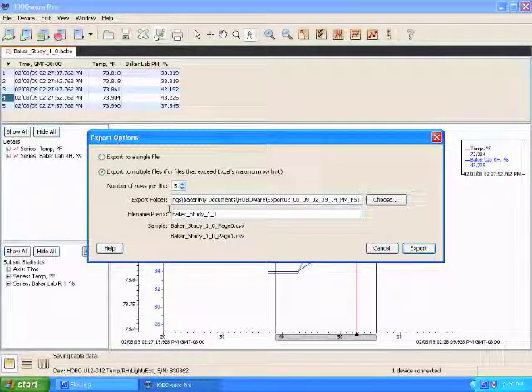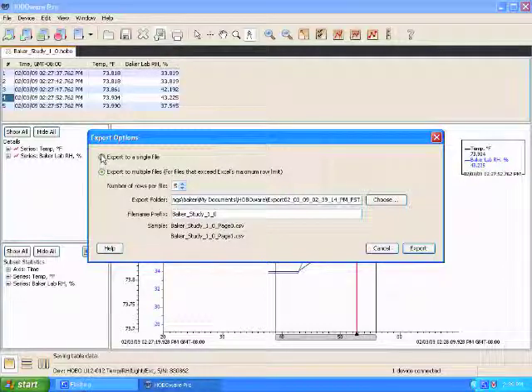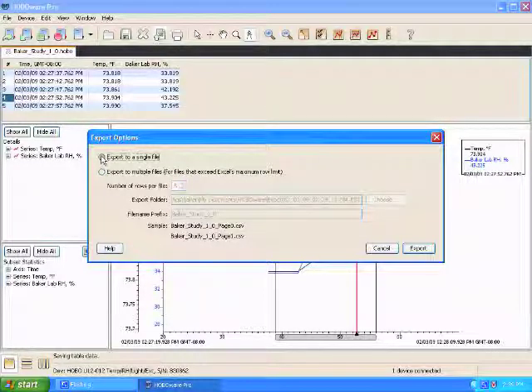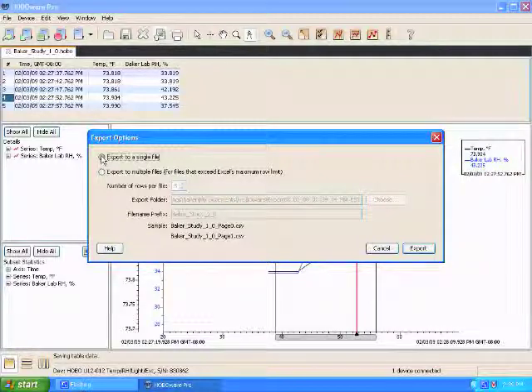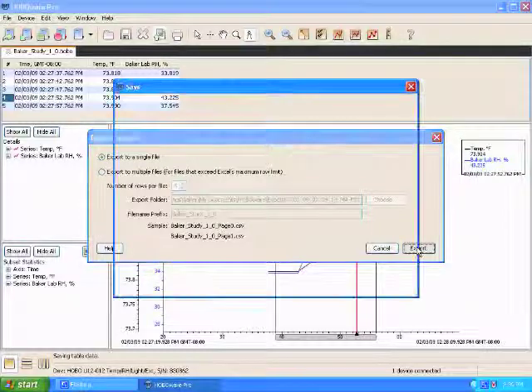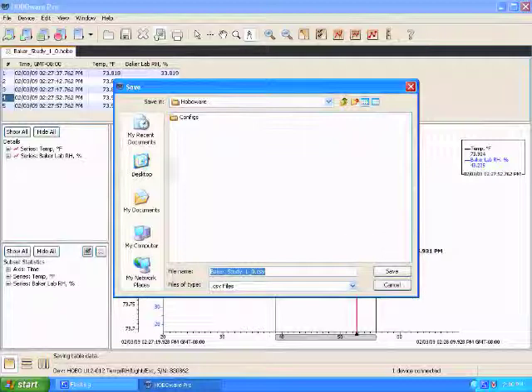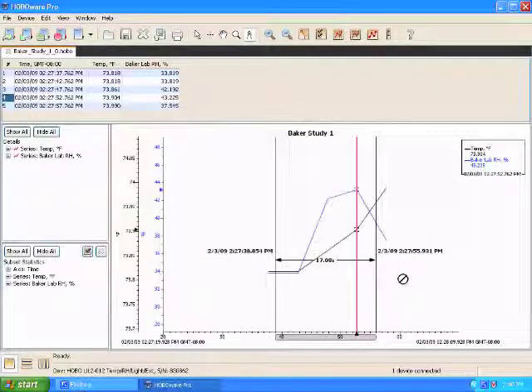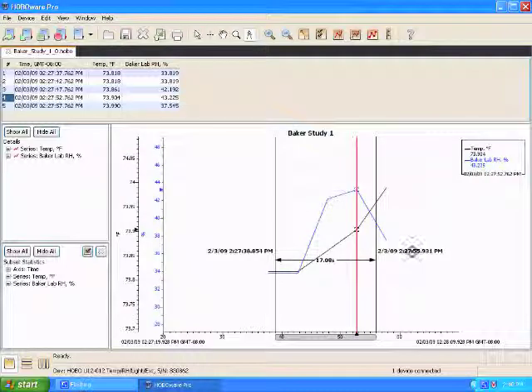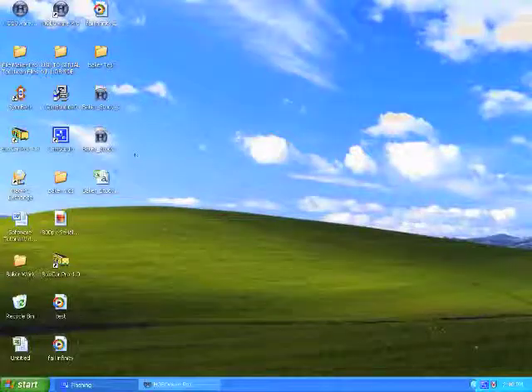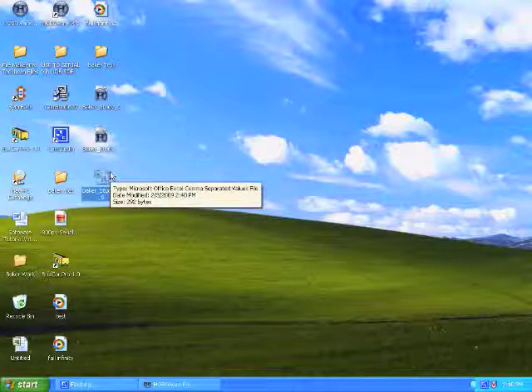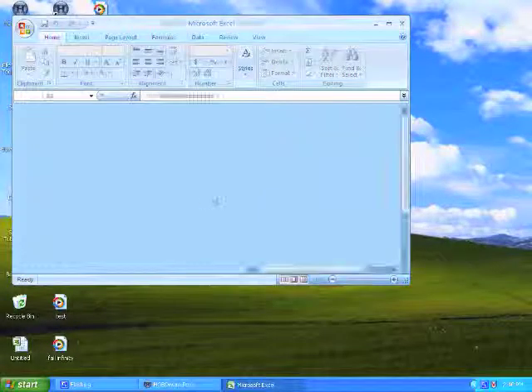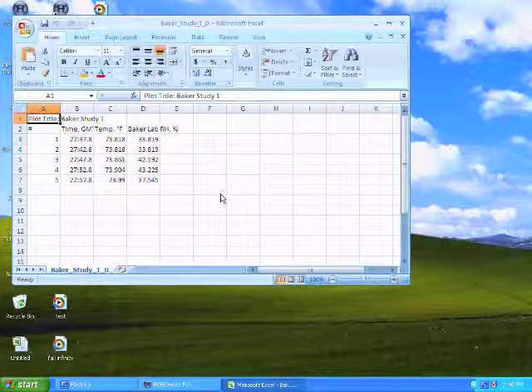And I'm going to save this. And now that's on my desktop and I can open it up. And this is useful if you want to manipulate your data in some way or if you need to create a different type of chart than HoboWare Pro allows you to make.